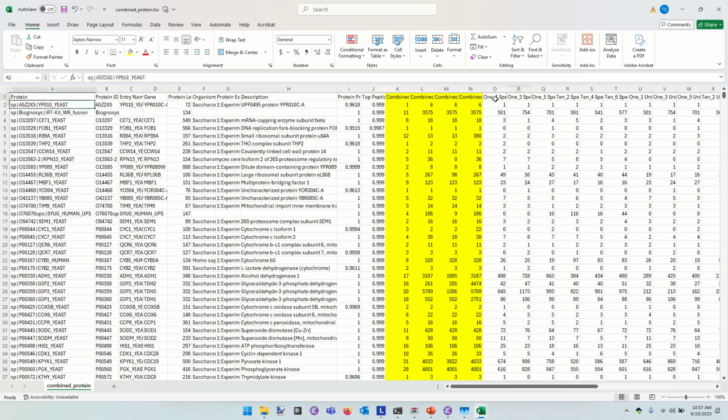How are these sorted? They're not necessarily sorted in a reasonable structure here. I might want to sort them by the amount of intensity they explained, or by the number of spectra matched to them. You can use all kinds of different sort orders for this. I think this is like alphabetical or something. Yeah, I'm pretty sure it's just alphabetical by accession. It's not usually a very biological way to look at things.